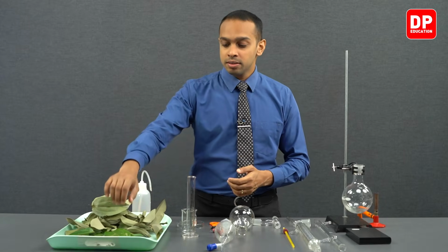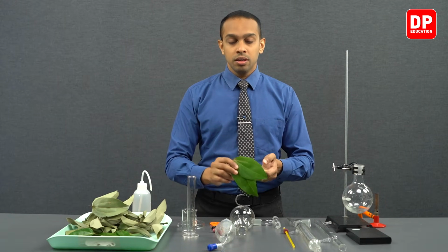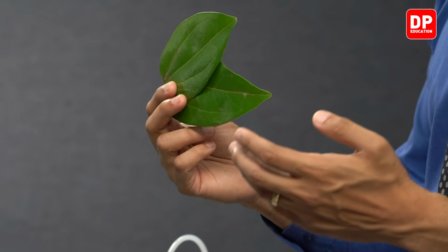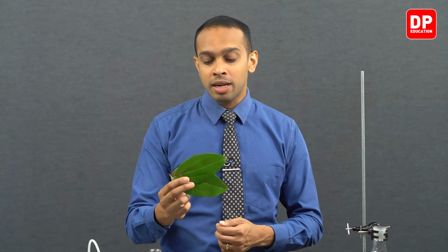We have here cinnamon leaves. Cinnamon leaves will be used for this extraction, and when you carry out this essential oil extraction from cinnamon leaves, the essential oil that is extracted is mainly going to contain an oil known as eugenol. So in this particular experiment, we will be using cinnamon leaves to extract cinnamon leaf oil.